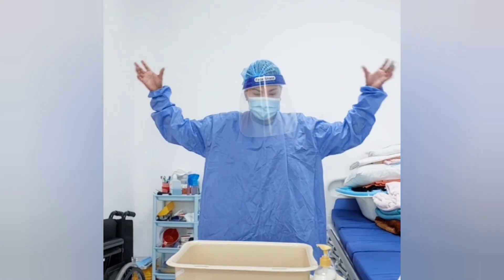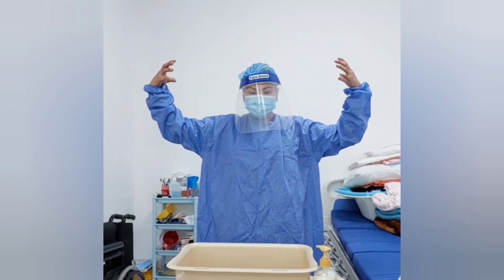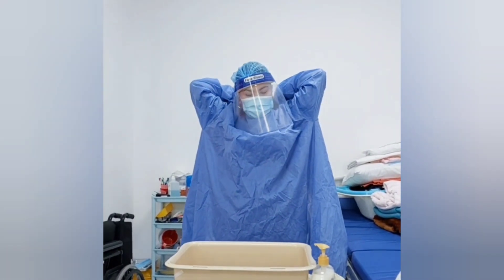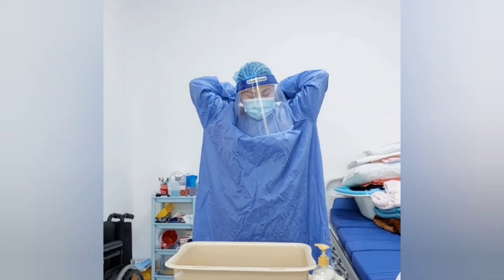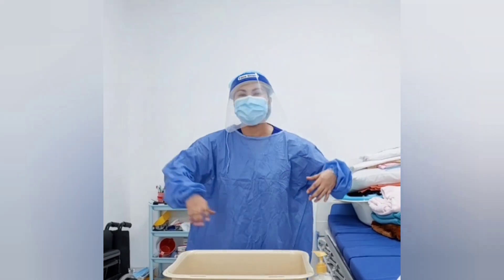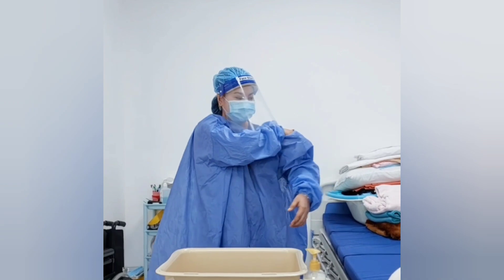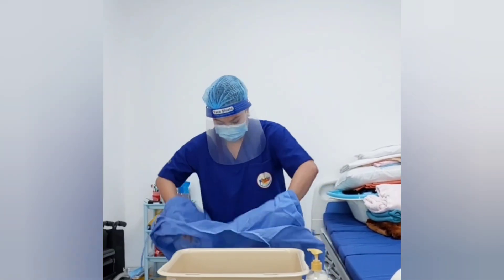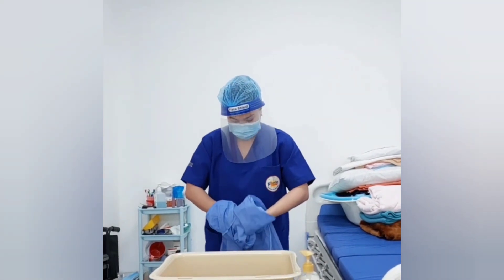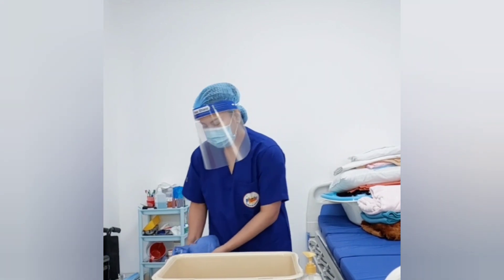Next, I will remove the gown. Make sure not to touch the front because it is a considerably contaminated area. Be careful to untie the gown bands so you can put your hands inside to doff the gown. Roll over from the inside and direct to the trash.